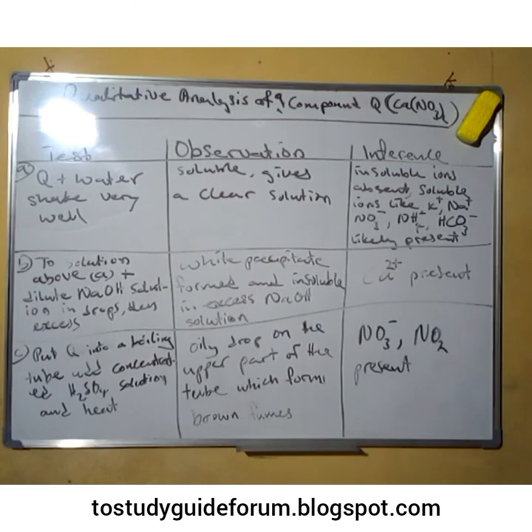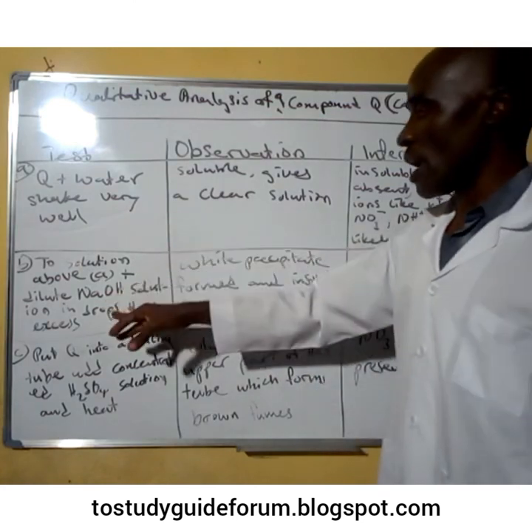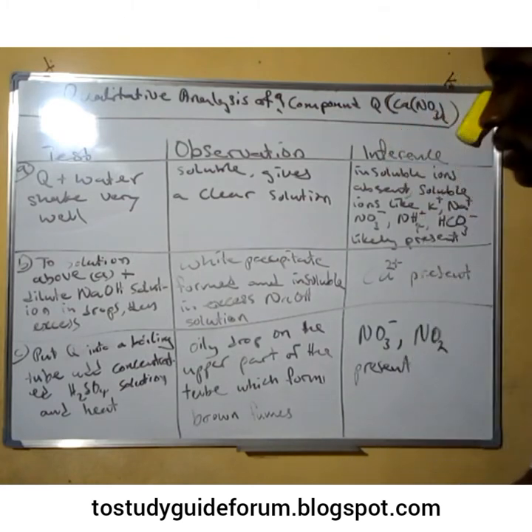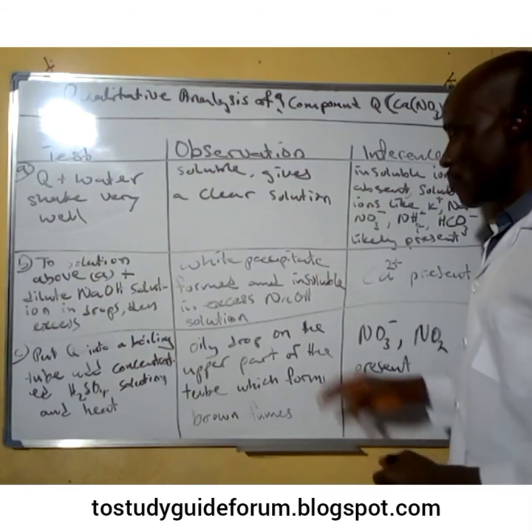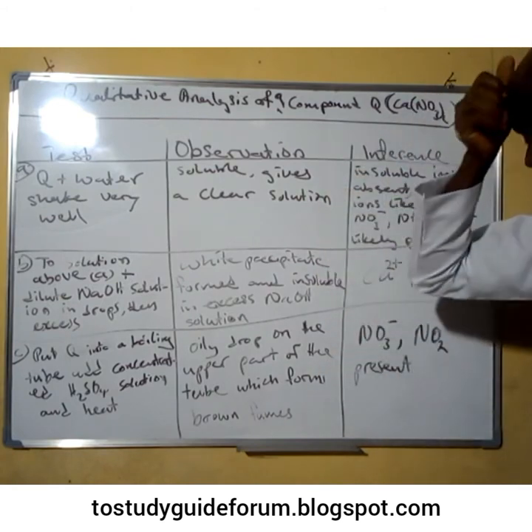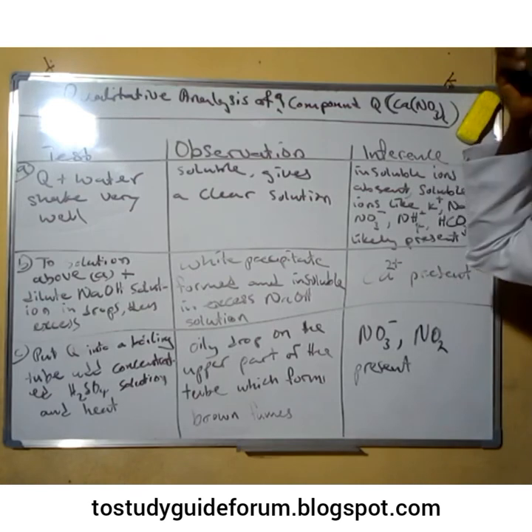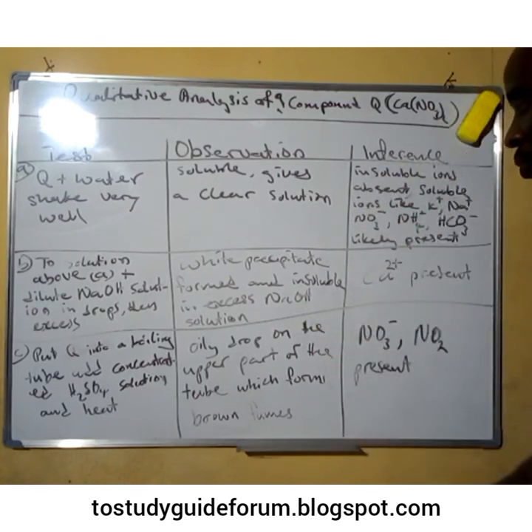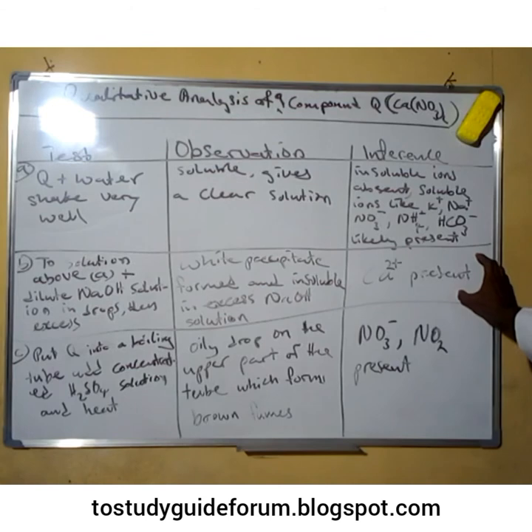Next, to the solution from the bowl we add dilute sodium hydroxide solution dropwise. In observation, we have white precipitates formed, and those white precipitates are insoluble in excess of dilute sodium hydroxide solution. This confirms that calcium ion is present.